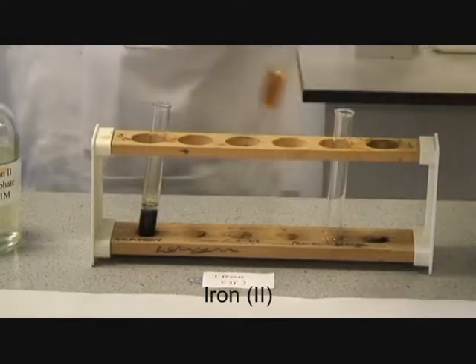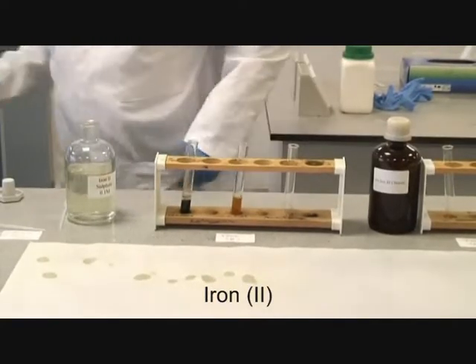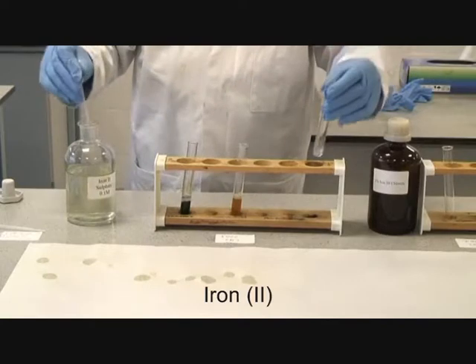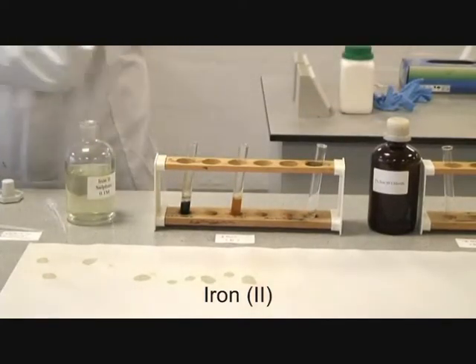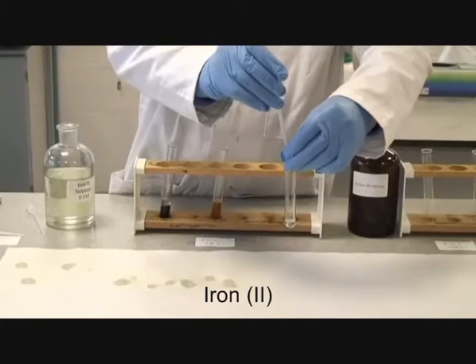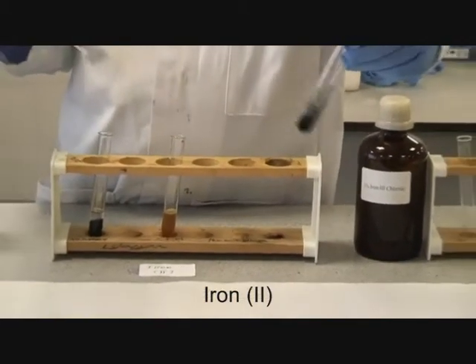You explain that effect. The addition of sodium carbonate to iron 2 gives a green precipitate.